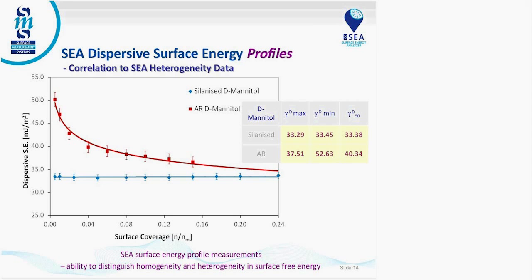Do you think surface and bulk amorphous material will have different Gibbs free energy? Well, one thing to understand is that Gibbs free energy, as we measure it, is a surface property. So it'd be tough for us to say whether a bulk amorphous content would be different, because by inverse GC it's a surface adsorption property. Would the Gibbs free energy of the total system be different? Yes, but we're only measuring the surface. If you're measuring by solution calorimetry or other techniques, you get a delta G and a delta H, but that's of the bulk. Here, just remember, we're only measuring the surface by inverse GC.